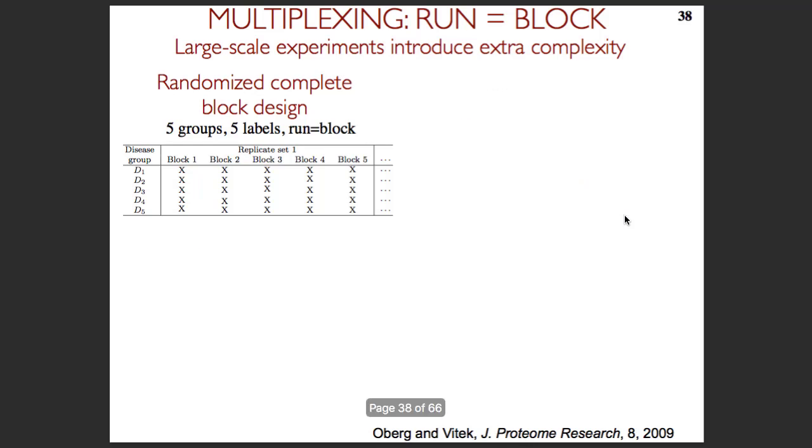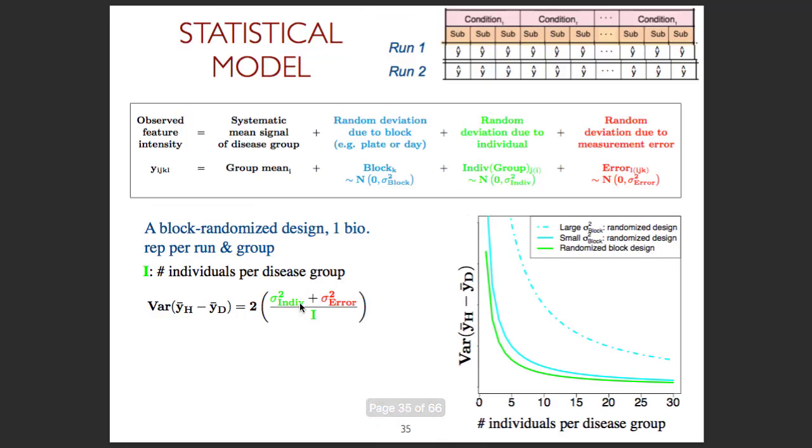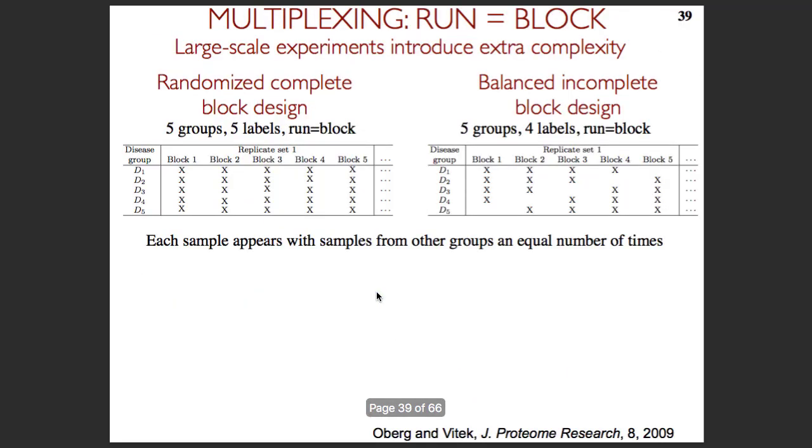Because what we do here in terms of variance components, we assume that, let's say you allocate samples to channels like this versus in some other way, your manipulation of the samples will give you the same type of variability, right? What you are asking is essentially label-based versus label-free. So what I can do, I can tell you variance components of this design versus 1 sample per run. But to calculate numerically what it would look like, you would need a pilot study of both to understand how much extra variability is contributed by extra sample manipulation from labeling.